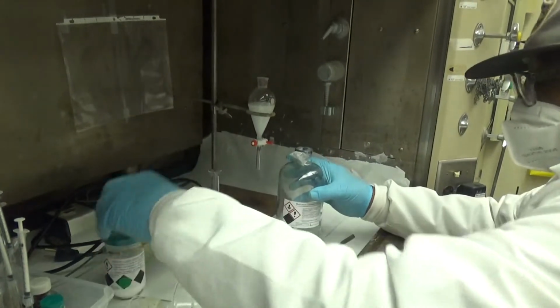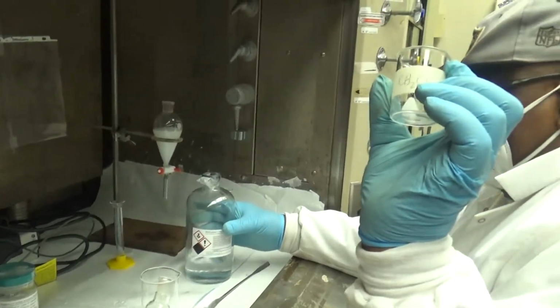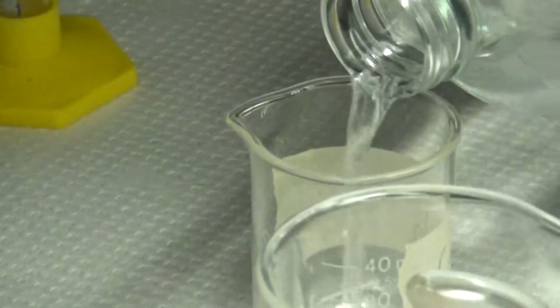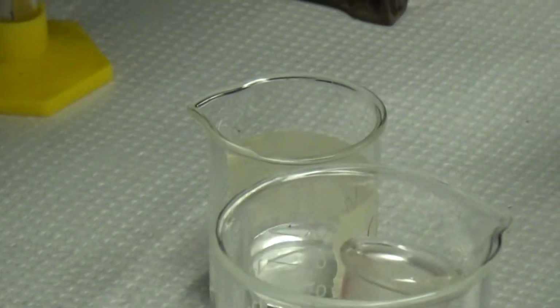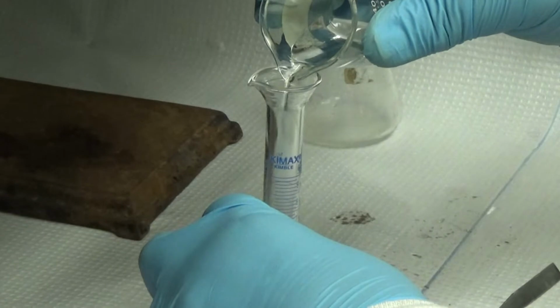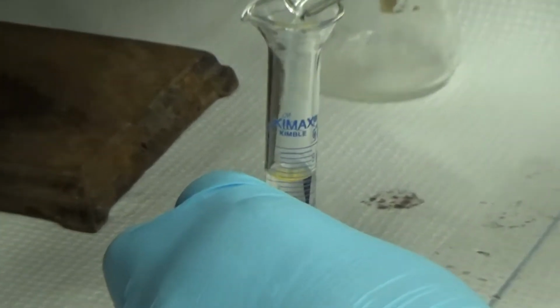Do you have a graduated cylinder? I have a small beaker labeled methylene chloride. I add methylene chloride into the small beaker, so 10 mils roughly. I close it, then use the graduated cylinder and add 10 milliliters in. Measure 10 mils. There's your 10 mils.